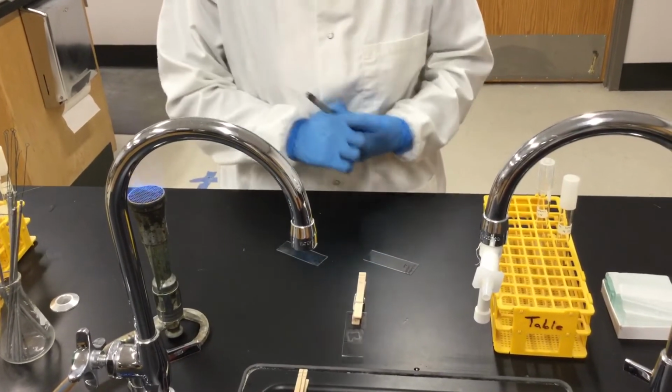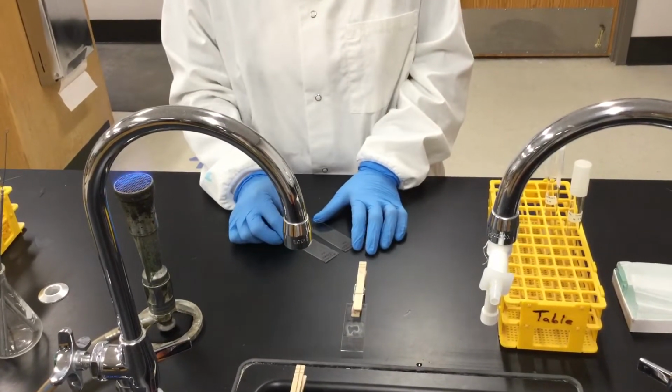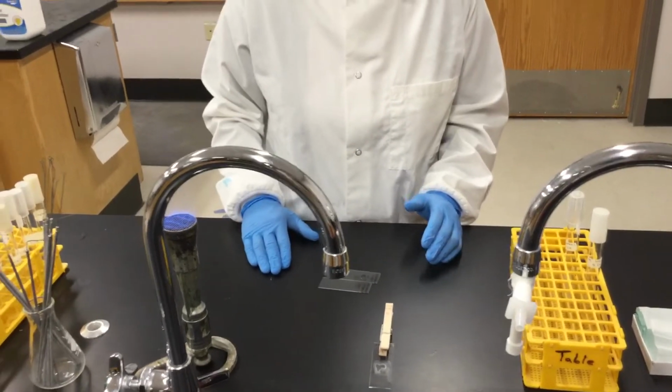Okay, so that one is almost dry. While it dries, what I'm going to do is explain the principle of the simple staining.